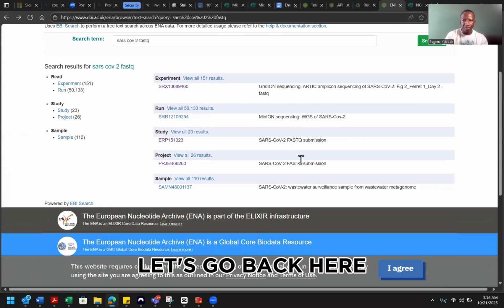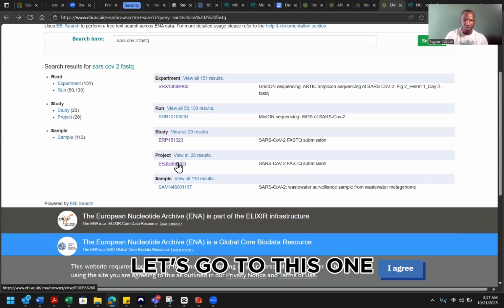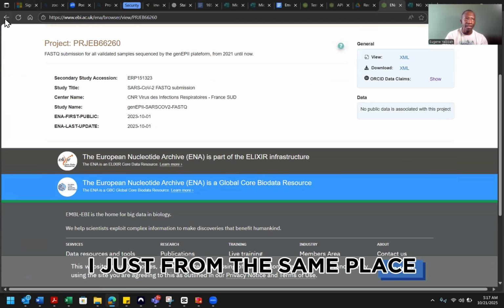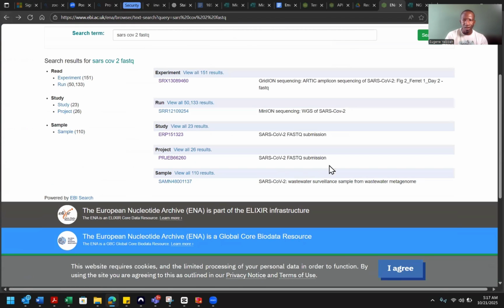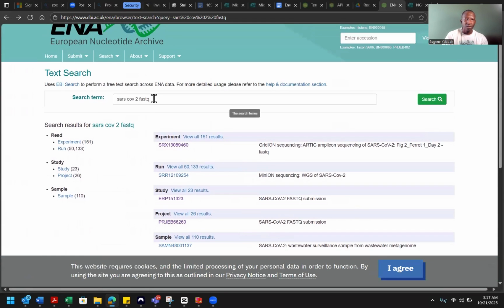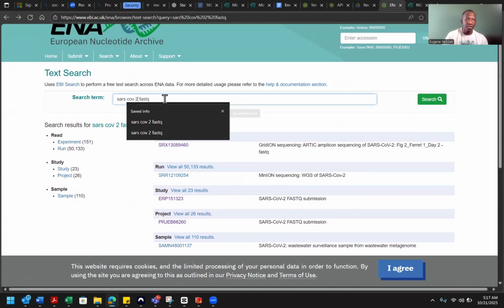Let's go back here. Let's go to this one. This is from the same place, same institution. Let's type in SARS fastq.